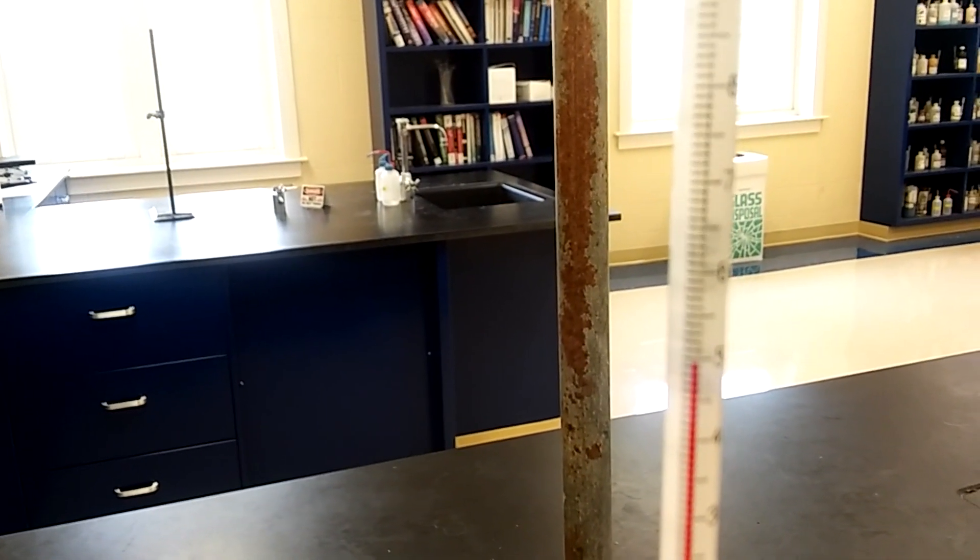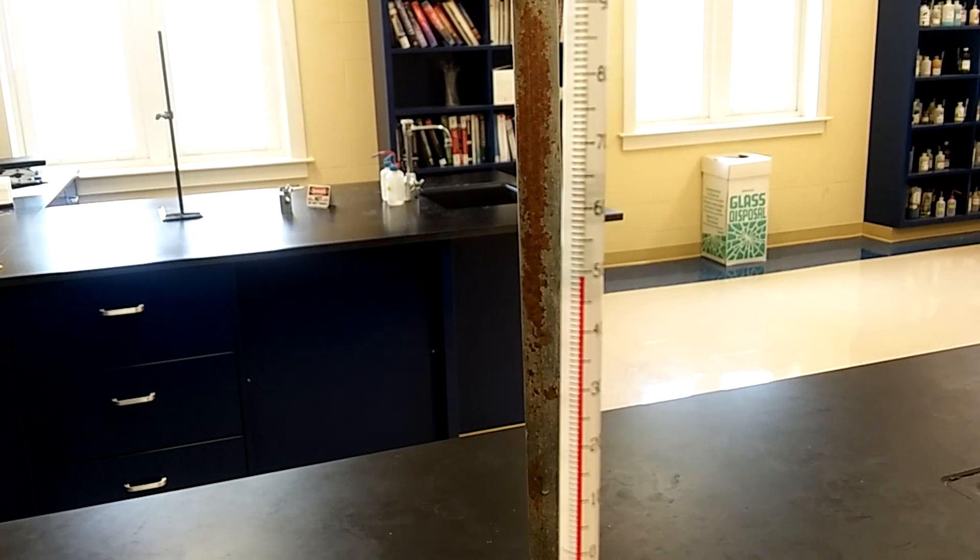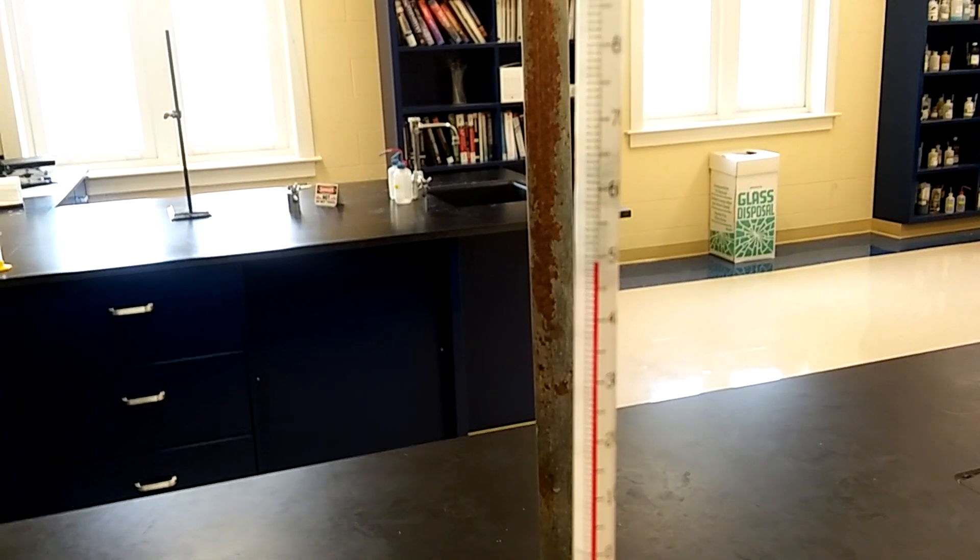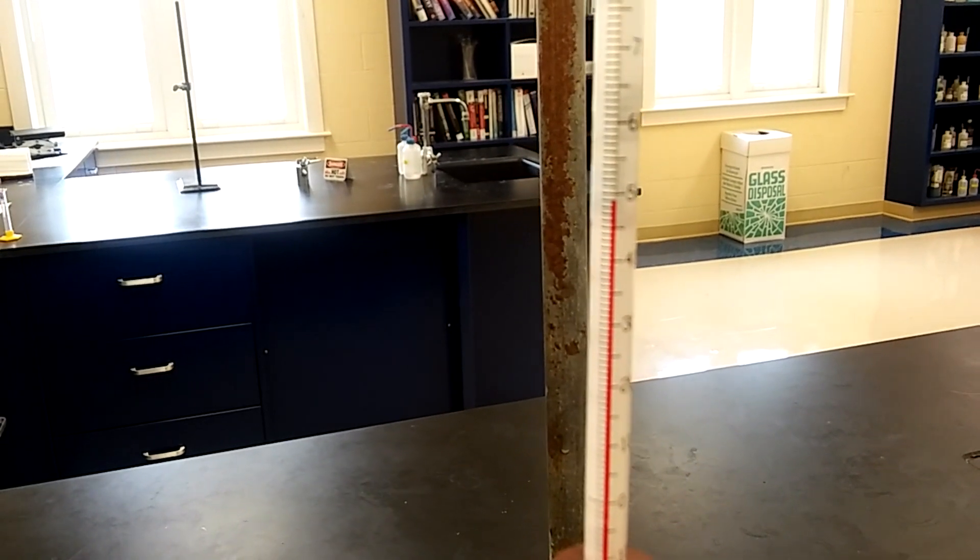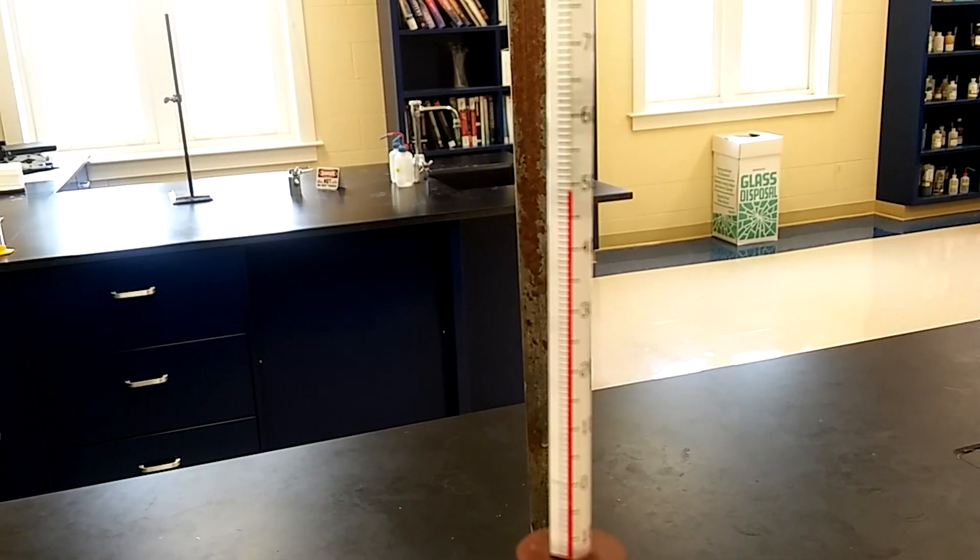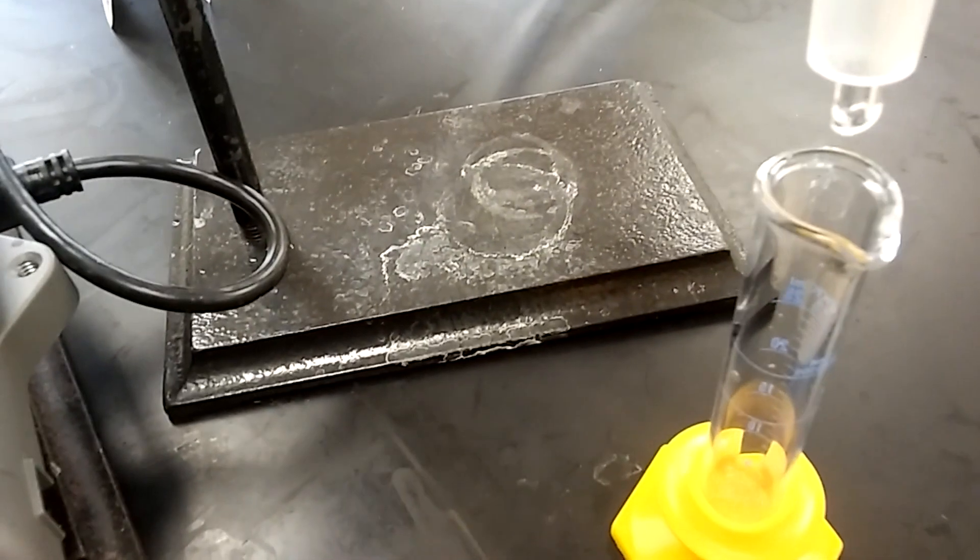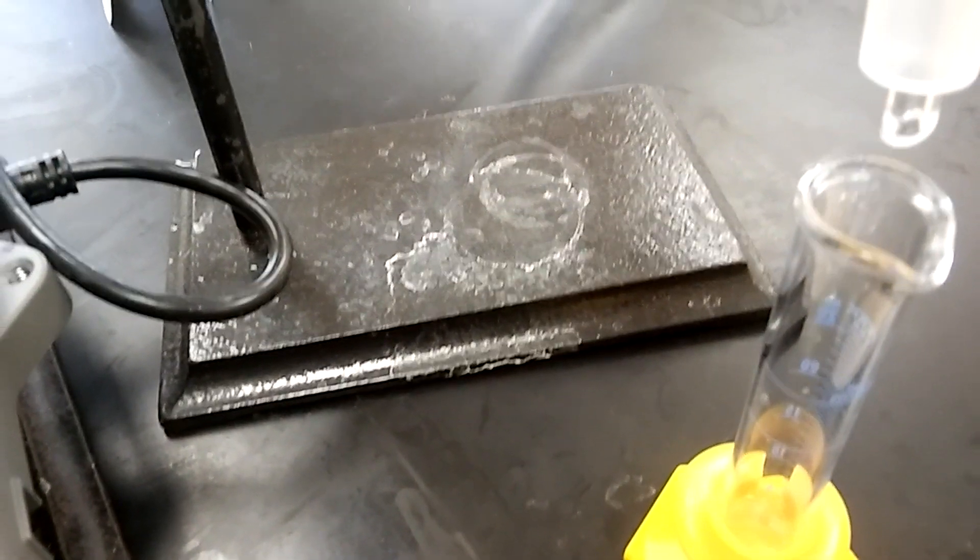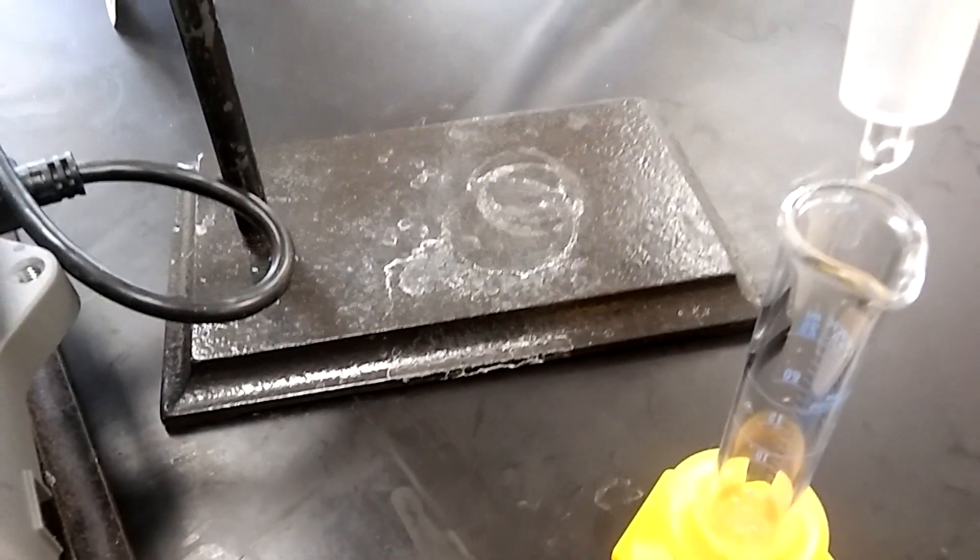I removed that flask I had earlier and put a different one. I started collecting everything that came about 48-49, and when it gets to 52 I'm gonna shut off the heat and put another waste beaker underneath. You can see that's t-butyl chloride right there.